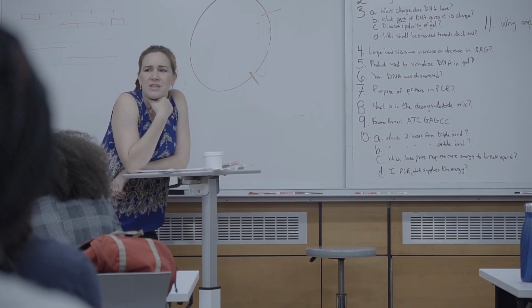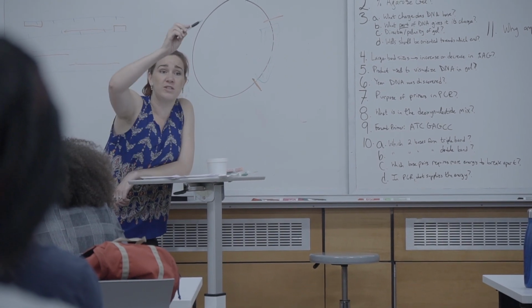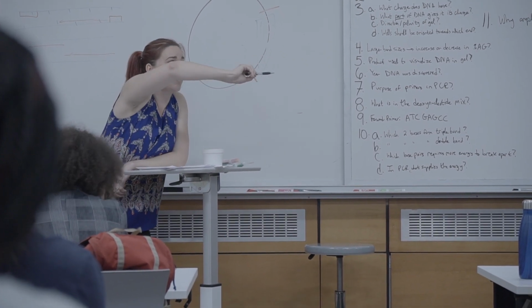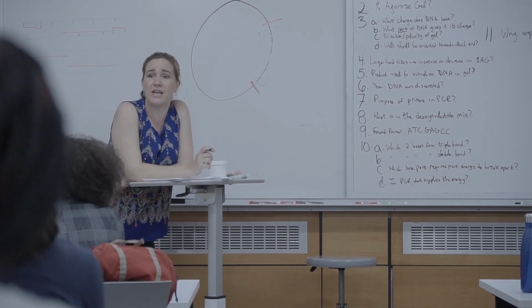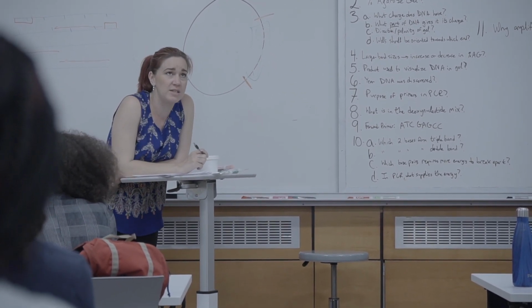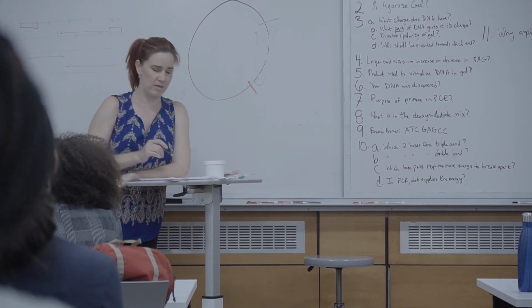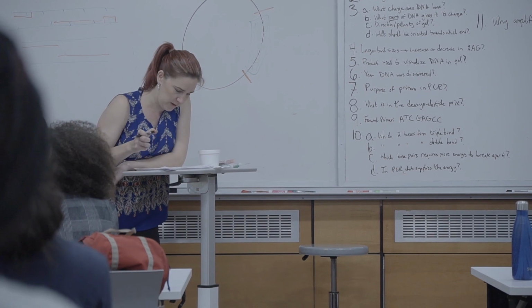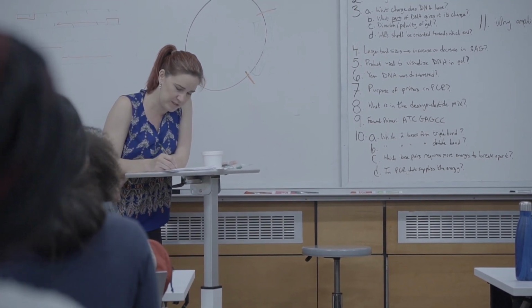And where's our blue juice at the end? It's at the bottom, right? Because it runs faster than a reaction. So all the blue juice is a line at the bottom. It has nothing to do with where the DNA actually is. So to actually see the DNA in the gel is SYBR Safe, or we didn't use this, but ethidium bromide. Great. So number 7 was, what was the purpose of the primers in the PCR reaction?